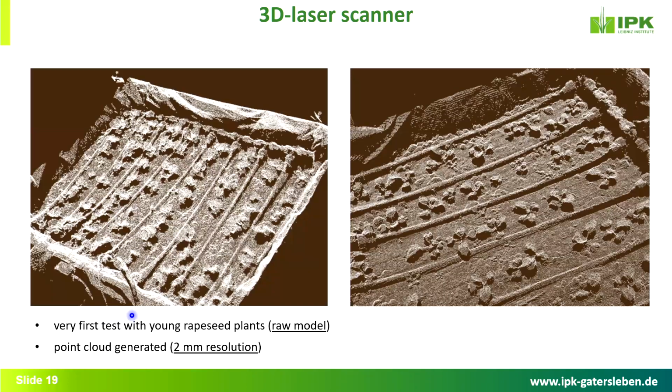Okay, so this is how it looks. On compartment 2, Dominic has produced nice images, and you can already see a lot of details on these small rapeseed plants, and also here you can see the droplet irrigation system. So we are quite hopeful that we can utilize it to its full potential.